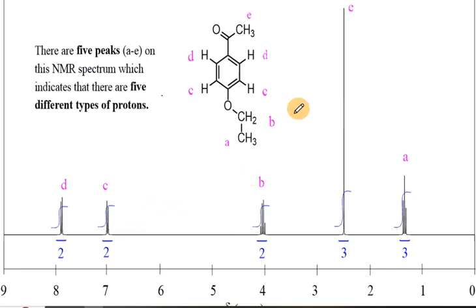So here, let's see the number of signals that this compound can display. We have 5 signals here. That means we have to have 5 different chemical environments for this compound. So for the chemical environment, we have the protons around this carbon in one environment. This proton and this proton, that's the two, are also in one distinct chemical environment. That is, their electron densities are the same. This one and that one are also in one distinct chemical environment. Then this one in one distinct chemical environment. Then this one also in one distinct chemical environment. So here we have 5 different chemical environments for this compound.